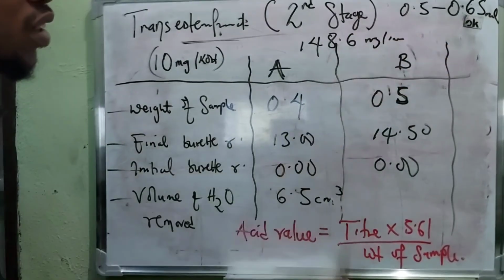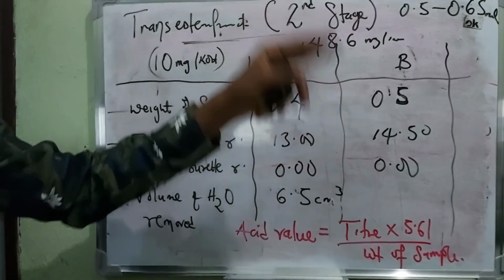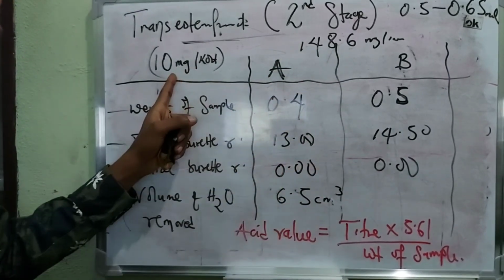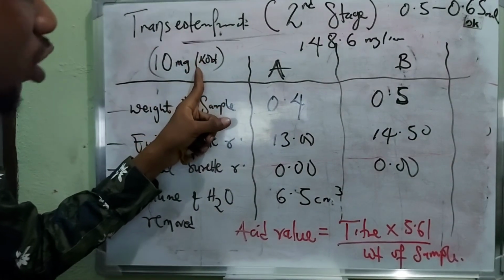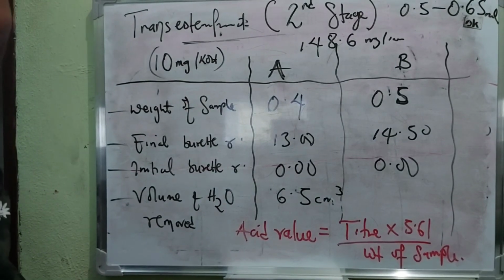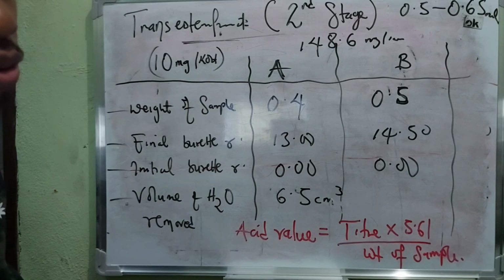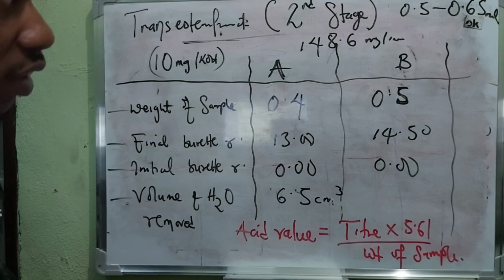This is telling you that even at 0 minutes, you still have a long way to go. So at another 30-minute interval, withdraw aliquots and repeat the same process. It drops little by little till it falls to about 10 milligram KOH per gram. Once you get to this point, that tells you that your alkyd resin has been fully synthesized. So guys, this is how you go about the alkyd resin synthesis, how to do the necessary weighing, which must be exact, and the calculations.